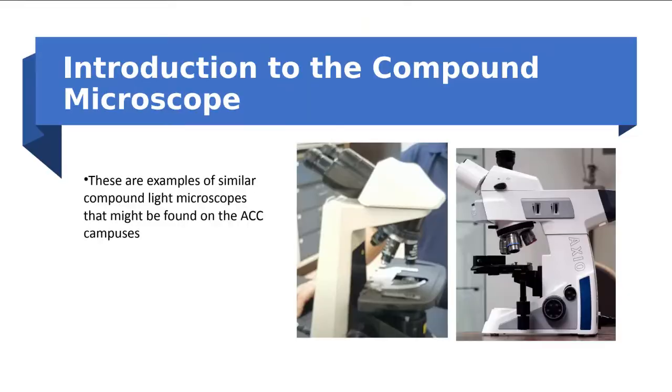There are some differences in microscope quality throughout the college. This is one that you'll see at HLC right here. But this is one that you'd see at Riverside. And they both work equally well. And so you should have no problem using the scope. Okay, so be sure you know the different parts of the scope. This might be review for a lot of people, but be sure that you're very, very familiar with the different parts of the scope. Okay, any questions?